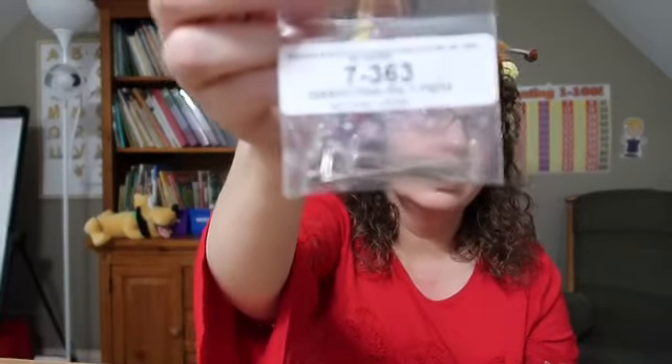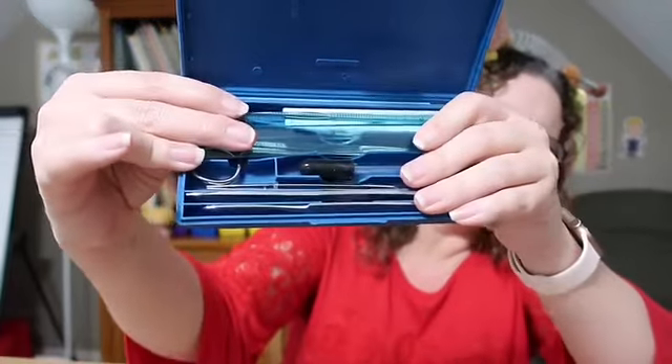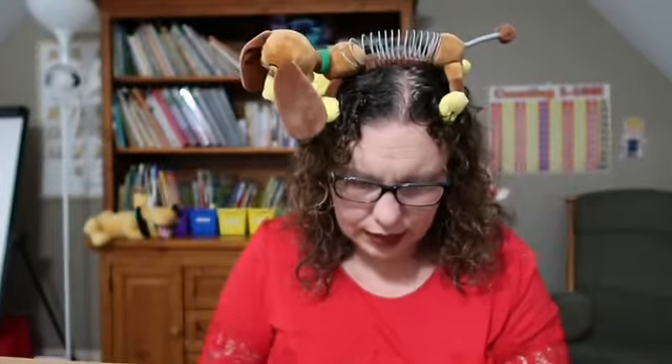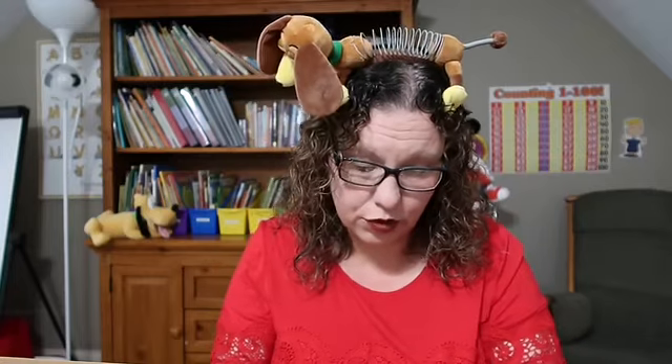There's a little blue case — I'm going to guess it's tools of some sort. Yes, these are dissecting pins. It's been a long time since I've done high school biology, so I don't remember what all of this stuff is. There are some other tools — I'll be a little careful holding this up because some of it is sharp — but it has scissors, scalpels, a ruler, a dropper, and some tweezers. Basically all the tools you need to do the dissection in a nice little case.